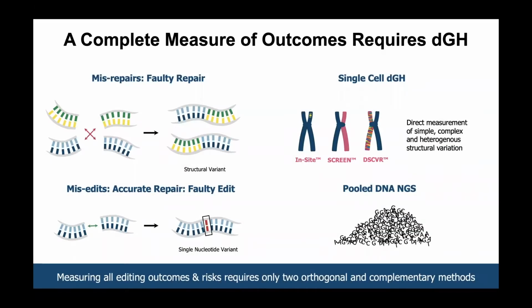When a genome is edited, there are two mechanisms that lead to editing errors, giving rise to two distinct classes of variants. Misedits are caused by faulty or off-target editing, forming sequence errors such as indels at either the edit site or off-target homologous sites. As sequence errors, misedits are successfully assessed by NGS, PCR, and other sequence-based techniques.